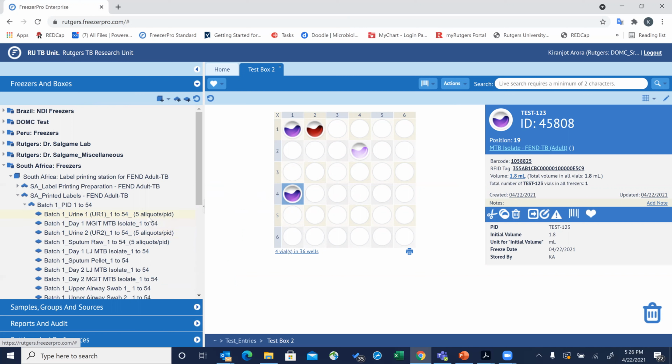But if, for example, on the first day you're only able to store 2 aliquots, then the second day you'll have 5. So that's how it will work. So maximum per day you can have 5 aliquots. So what will happen is you'll have a surplus of 3 aliquots for which you have printed the labels, but you won't actually be using those labels and those virtual samples.